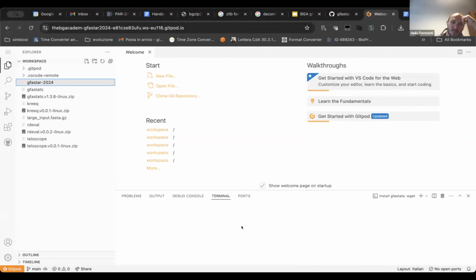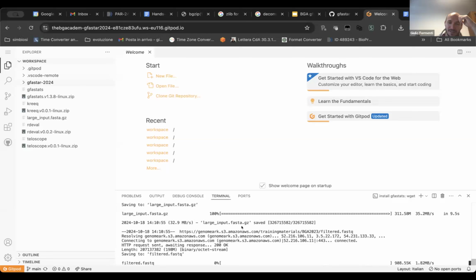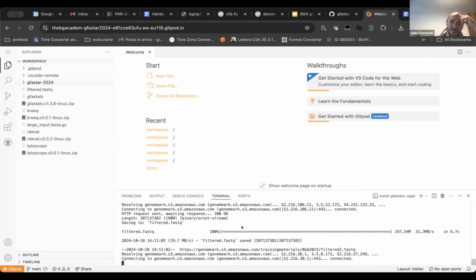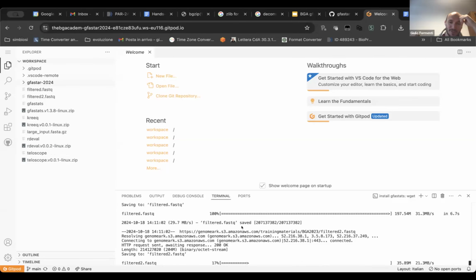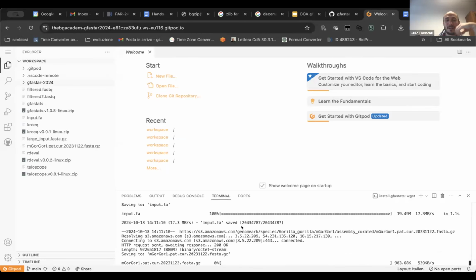We have releases with binaries for Mac, for Linux, Windows. And honestly, if you just make into the folder, it would compile most of the time, because we're trying to keep it simple, not having millions of dependencies that need to be there for this to work. But again, if you have problems with compiling, let us know.